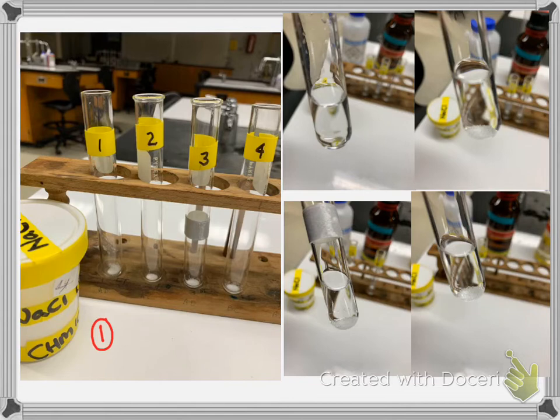Then I measured out 3 milliliters, and I didn't show you all those steps because it just was taking too many pictures. So I added water. So all of these are with water. This is test tube 1, this is NaCl. And NaCl in water, you can see that it dissolved.